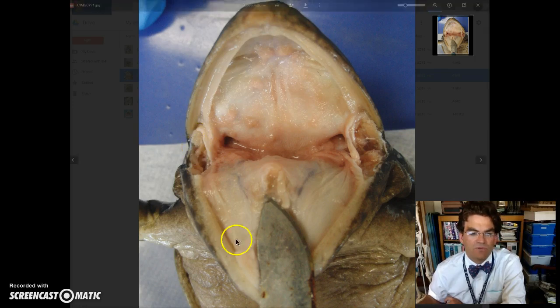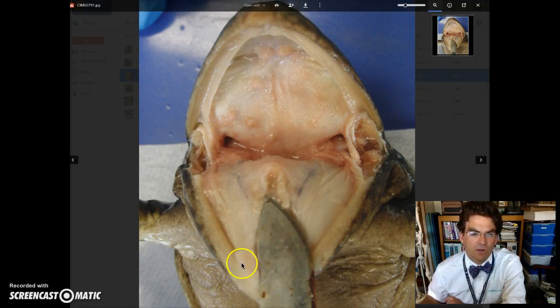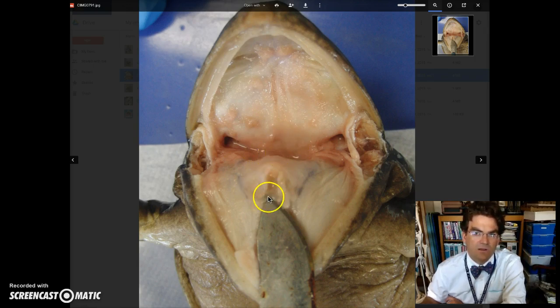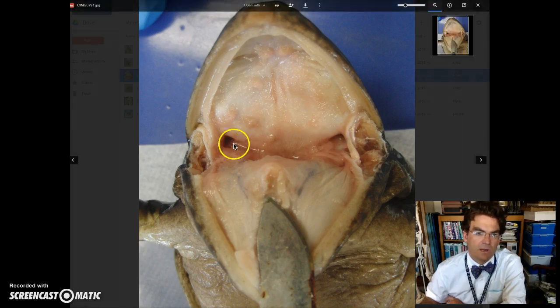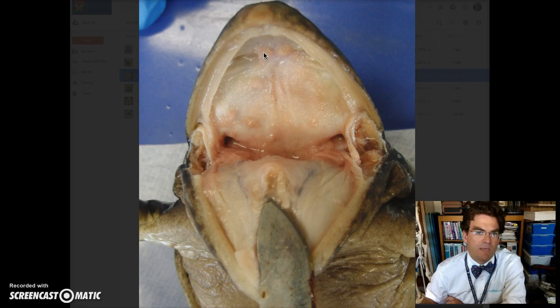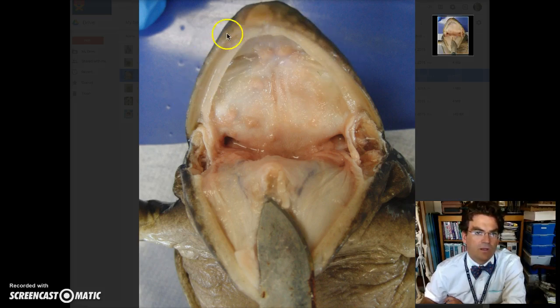So just one last review: we've got the tongue here, then we have the esophagus here, we have the glottis here, then we have the eustachian tubes right here and right here — so those two things are the eustachian tubes. We have the vomerine teeth right here, and then we have the maxillary teeth, and they run all along the upper lip there.